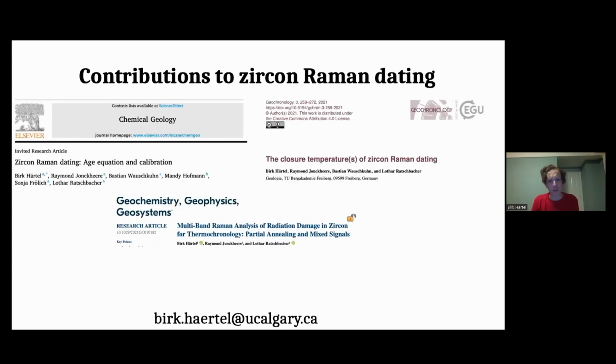Okay, so to give you a short overview again about what our contributions to Zircon Raman dating were, I can refer you to the publications that we wrote on it, which include the calibration of the damage against the Raman spectrum, the determination of the closure temperature for Zircon Raman dating, and data analysis of Raman spectra for Raman dating, which includes annealing detection and also some Raman-specific artifacts.